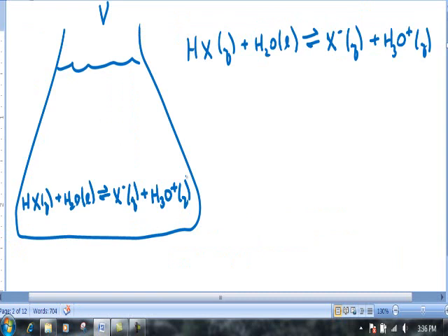If we take a close-up look at what's taking place in the weak acid solution, we can follow and understand what takes place when we generate our titration curve. The equilibrium for the weak acid will be taking place in the solution. This would be the weak acid equilibrium for an aqueous solution of a monoprotic weak acid. Now, drop by drop, we add sodium hydroxide from the burette.